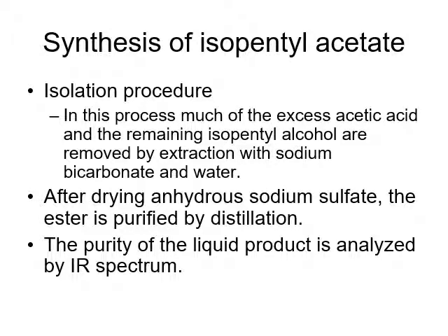So the synthesis of isopentyl acetate is an isolation procedure. In this process, much of the excess acetic acid and the remaining isopentyl alcohol are removed by extraction with sodium bicarbonate and water. Just another example of how extraction is very important. I would say it's as important as the reaction. Whatever we do afterwards, the washing is as important. So after drying with anhydrous sodium sulfate, the ester is purified by distillation. So the purity of the liquid product is then analyzed by IR spectrum or NMR or mass spectrometry.